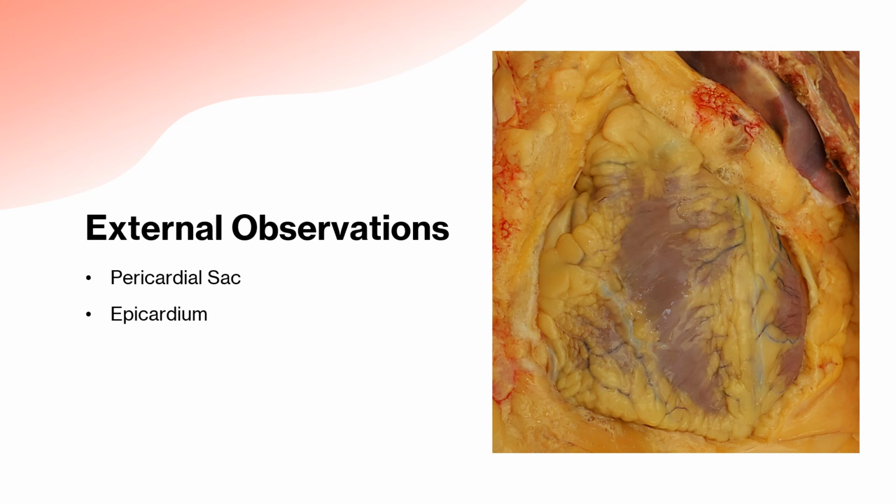And why I say this is we've got an open pericardial sac. We're looking at the anterior surface of the heart. And we've got nice exposed brown tan muscle, as well as appropriately placed adipose tissue overlying the vessels of the heart here.